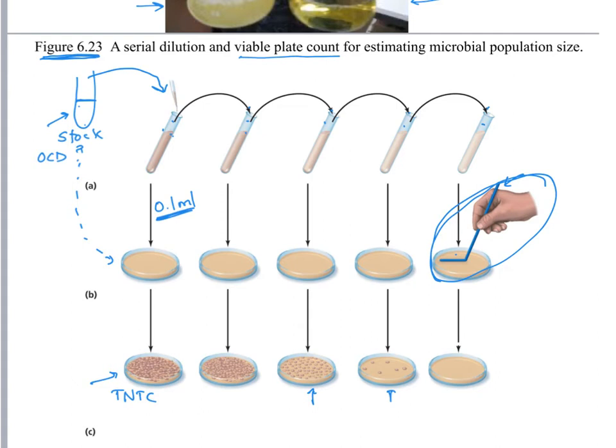And that's generally one of the things that students enjoy the most because, of course, you have to get this glass hockey stick. You have to sterilize that, so we do that by dipping it into some alcohol, catching it on fire, letting it cool down a little bit, and then using it to just kind of spread those cells around as best we can.